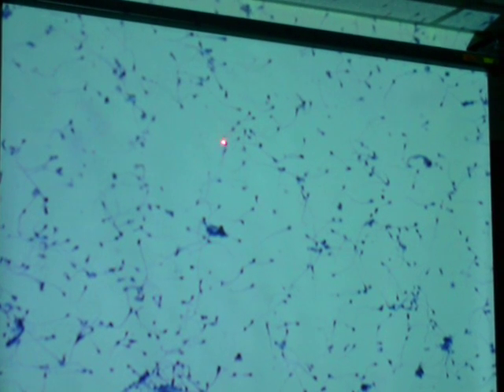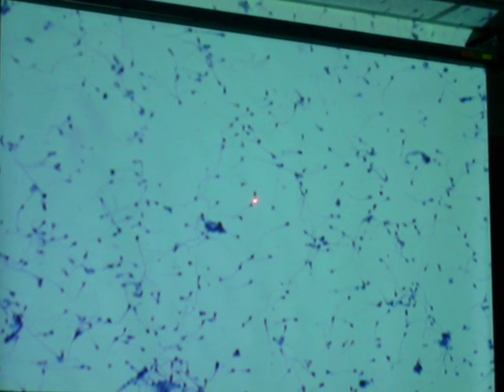So there's a smear of sperm. There's a little dark spot to meet a head and then you follow the long tail.